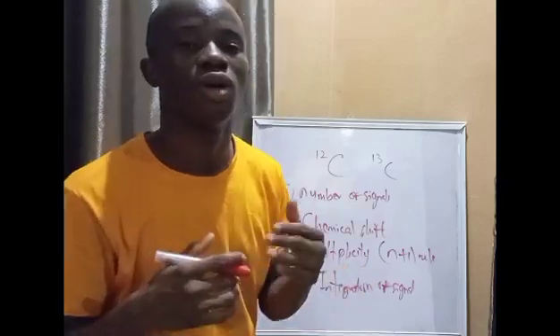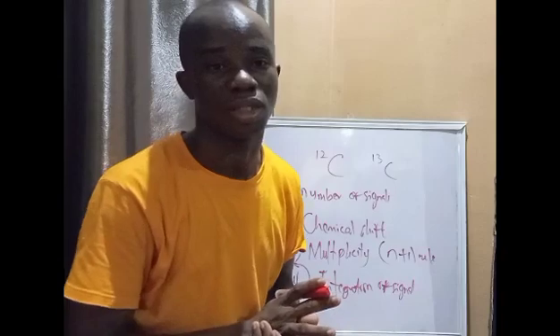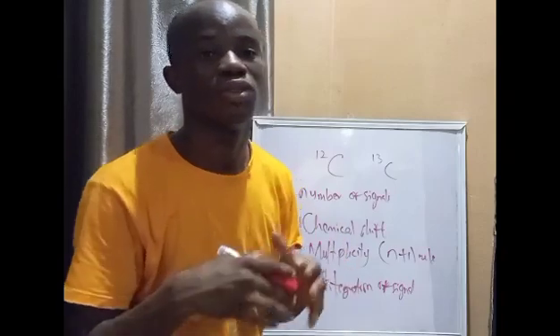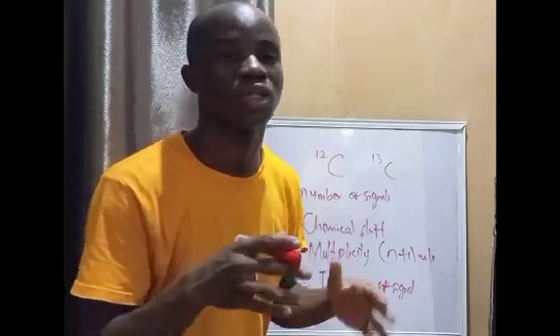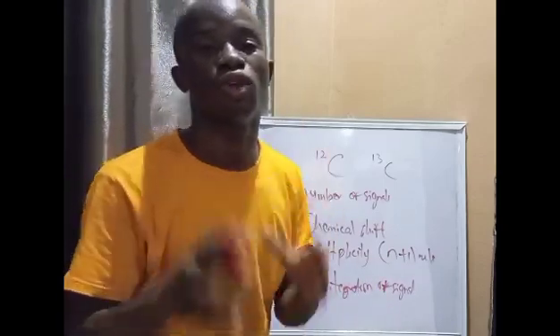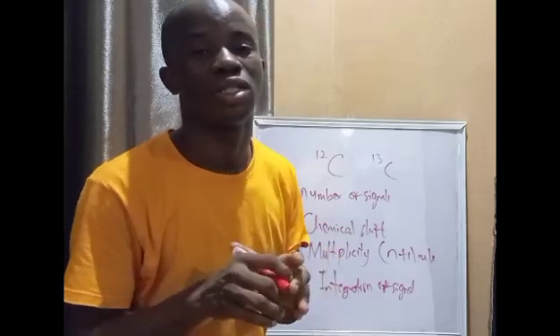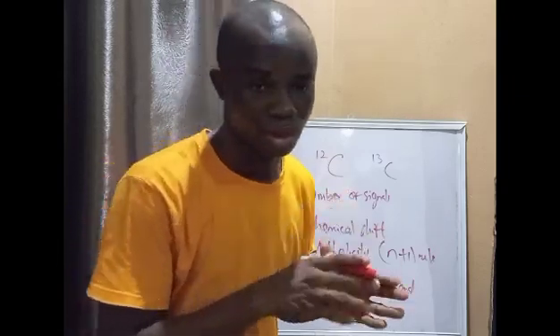And integration of a signal is usually indicated by the area under that particular signal. They can always give you the values for the areas under a particular signal so that you can be able to determine the number of protons that are responsible for a particular signal.